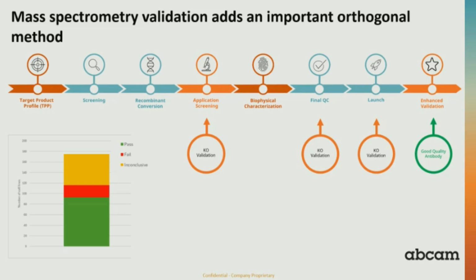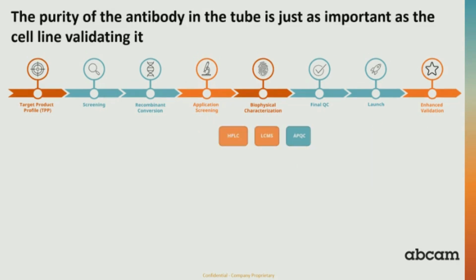And what you end up with is an antibody that has the quality in the middle, and it's a good quality antibody that comes out the back end. So I'll switch gears to quality in terms of antibodies. This comes back to some of the comments we've had earlier about knowing what the thing is. What is in the tube? Do we actually know what's in the tube?